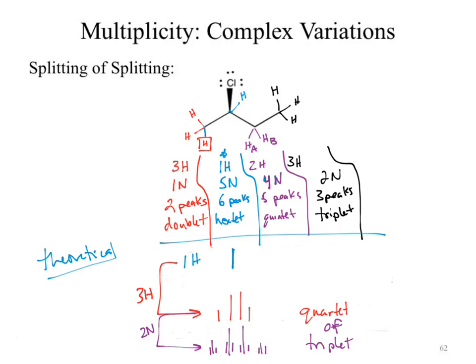Is a triplet of quartets going to look the same? No, the patterning is going to be all slightly goofy off of it, but it gets you the same general idea. Okay? Don't look too excited. One question. Okay? Another big common place where this shows up.